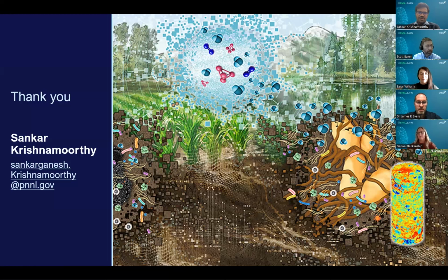As for the probe amount and the cell volume, usually we do those labeling with, for example, 50 microliter sample with 0.5 to 1 OD worth of cells. And the probe concentration varies depending on how effective those probes are. We screen, for example, from 0 to 1 micromolar. All right, thank you.